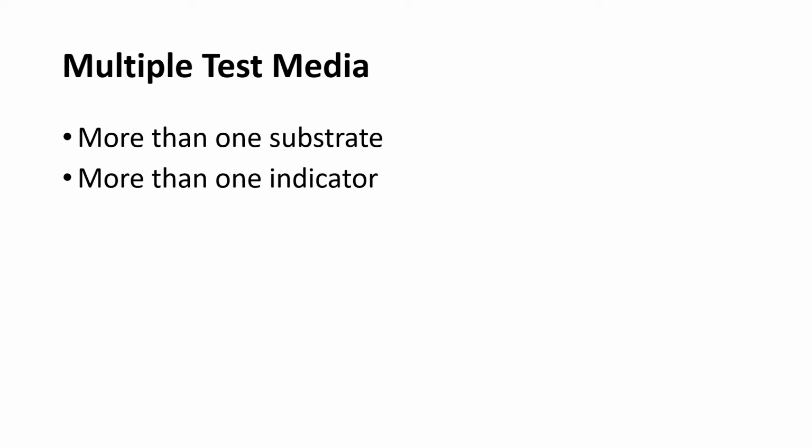So for multiple test media, that means you have more than one substrate in each type of media. Also, there will be more than one indicator in the media. And you will be looking at more than one reaction in the media.